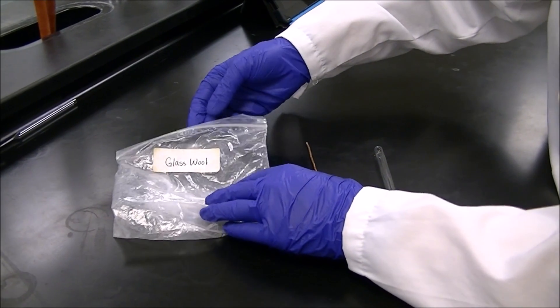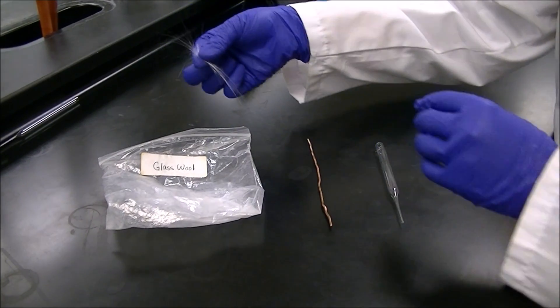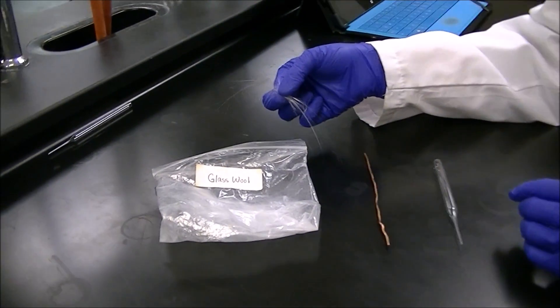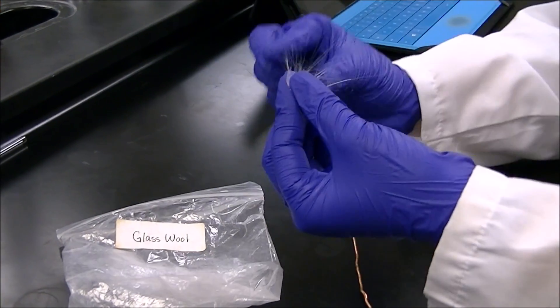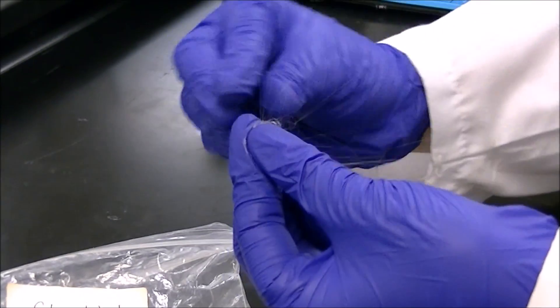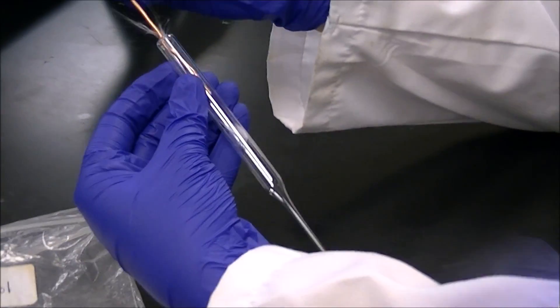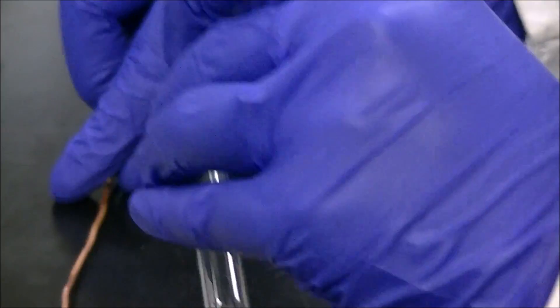We need to create a plug that goes in the bottom of our column. The plug prevents the stationary phase from falling out of the column, and our plug is made out of glass wool. You'll see Ashley will form it into a tight pellet. Then, the plug is placed in the column and stuffed into the nose with the copper rod.